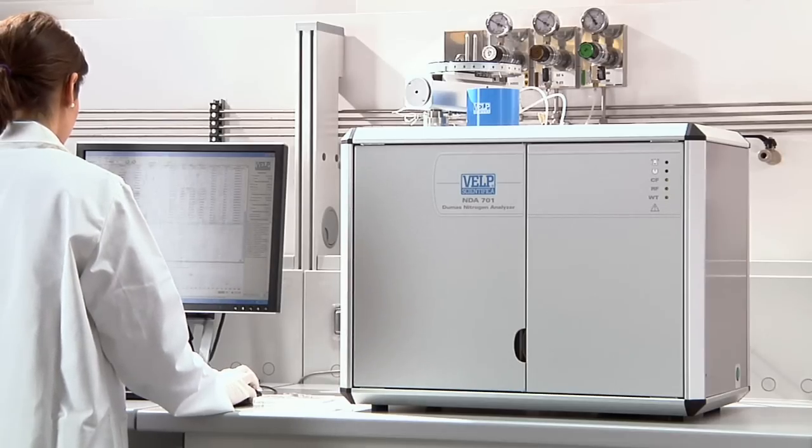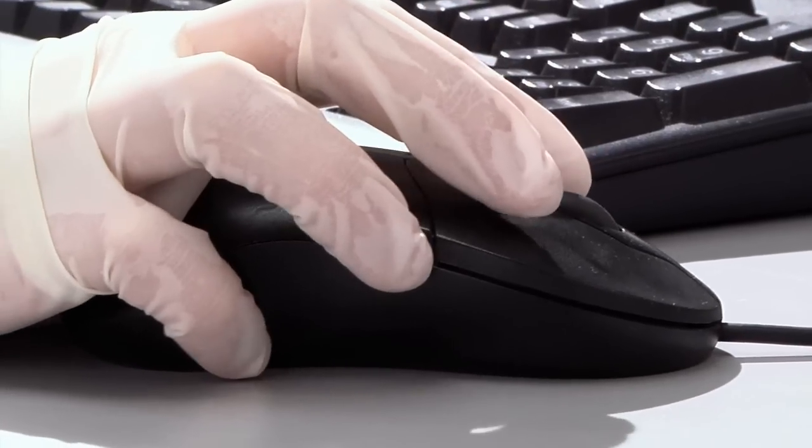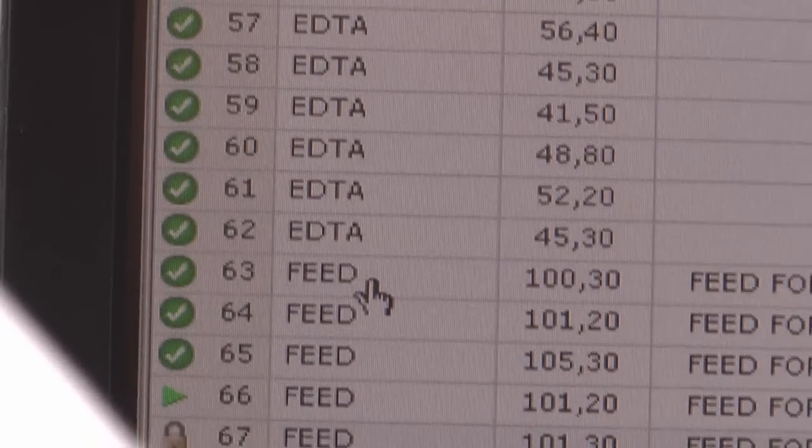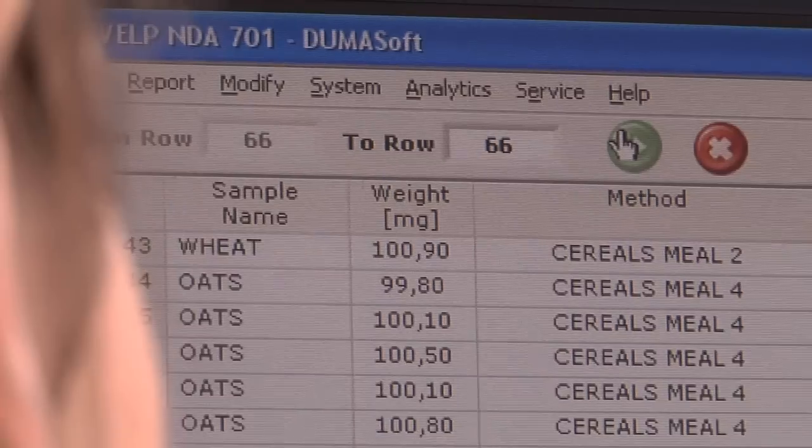Automatically, the sample is purged in a stream of helium, eliminating all traces of atmospheric nitrogen, essential because the NDA 701 is able to reach particularly low detection limits.